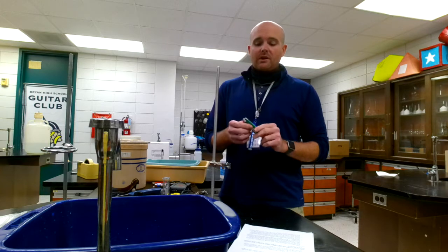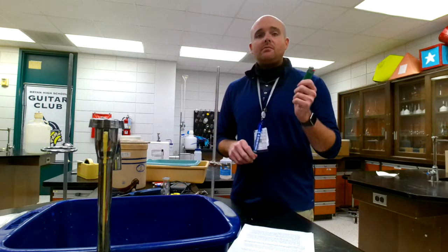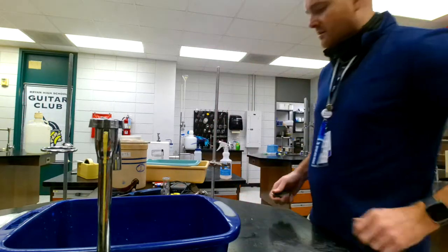We're going to check out the fuel in a Bic lighter. We are going to try to experimentally determine the identity of the gas that's in here just by using some pressure, volume, temperature, and number of moles calculations. If you hadn't guessed, this is the ideal gas law, and it's going to be awesome.